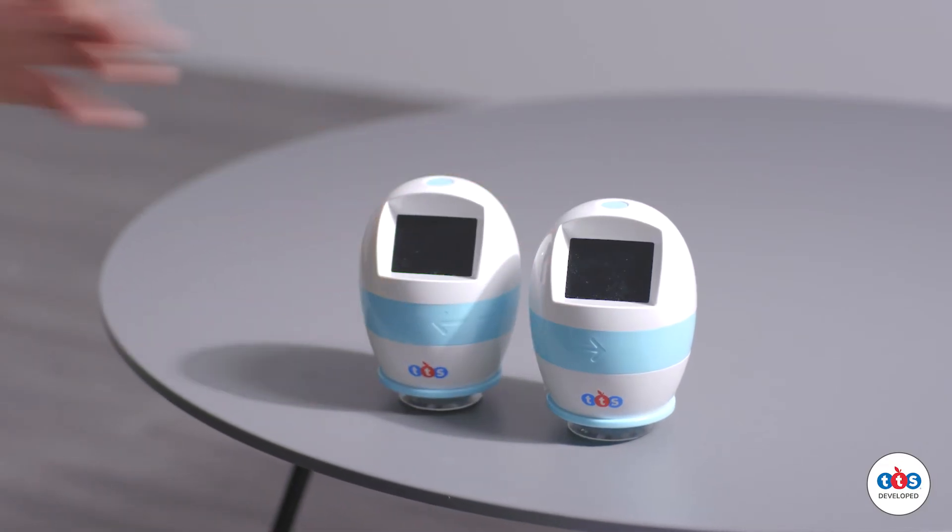The microscope has a 10 meter range and is fully compatible with iOS, Android tablets and Windows.